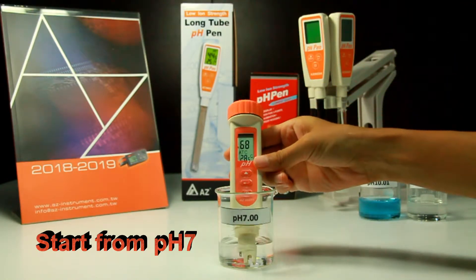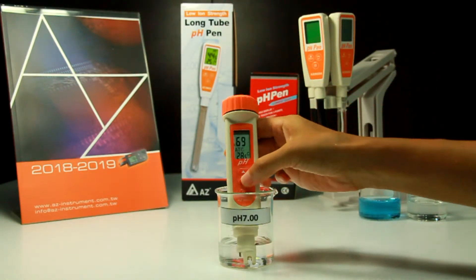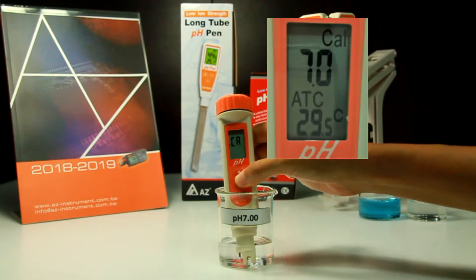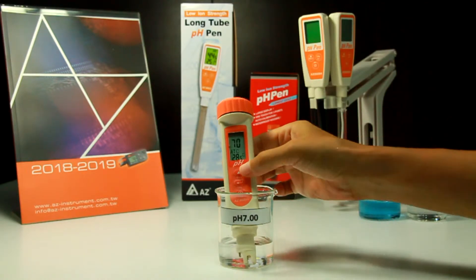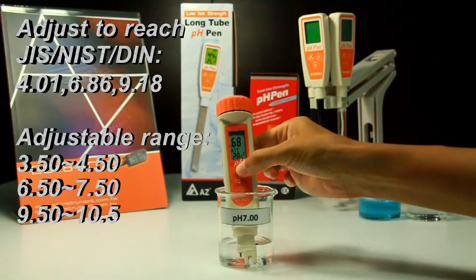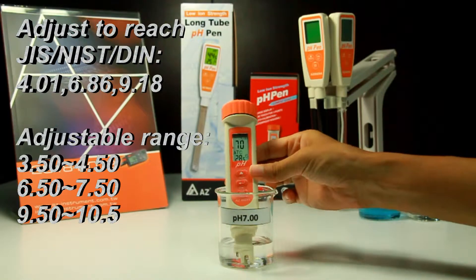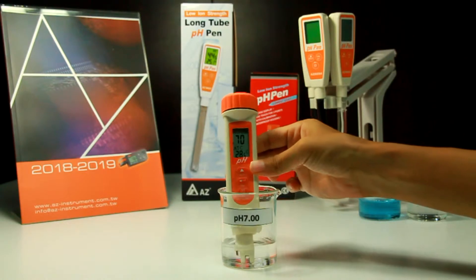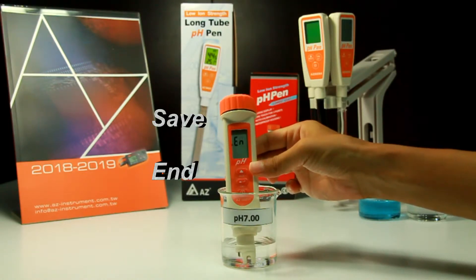Dip the electrode into PH7 buffer and stir gently. When the reading is stable, press the calibration key to enter calibration function — you will see CAL flashing on the display. The PH pen will auto-recognize the buffer. If the recognized value differs from what you are using, press the up key to adjust until the reading matches your buffer. Stir gently until stable; you will see the save icon and end icon appear on the display.